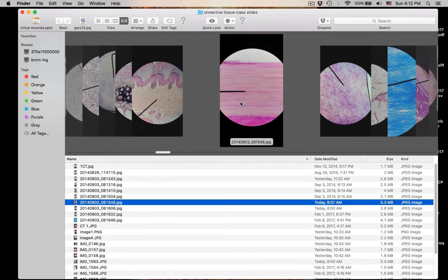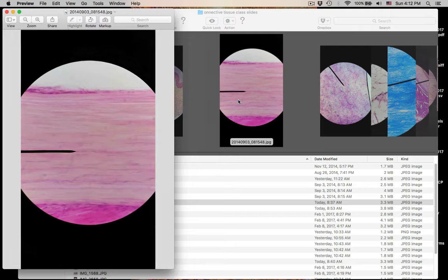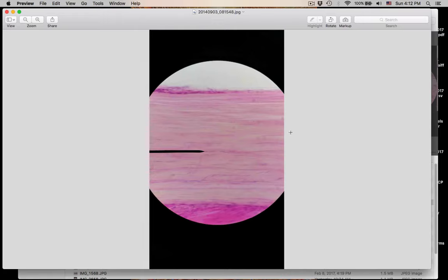Number seven — kind of blurry, but this is dense regular. Dense regular. You can see the protein fibers are in a parallel pattern.